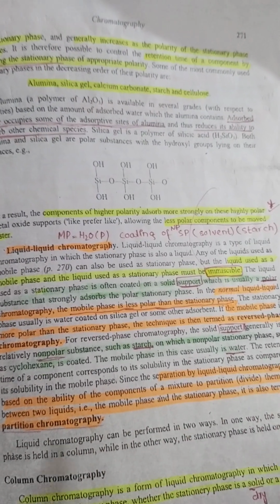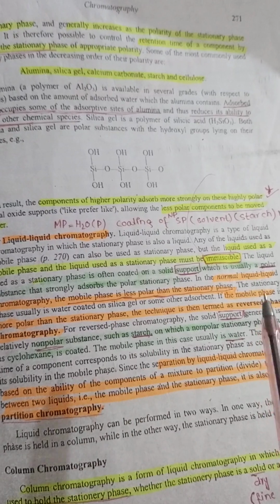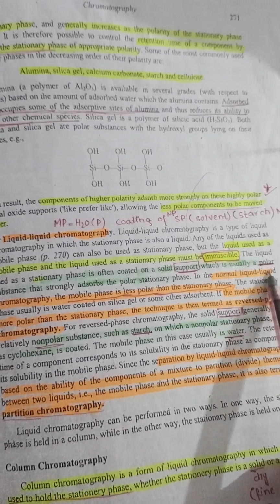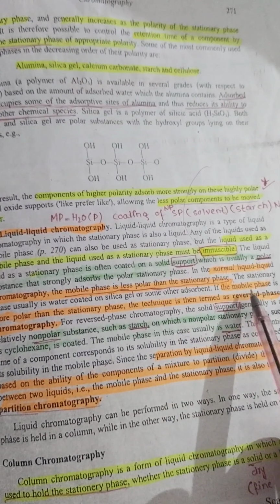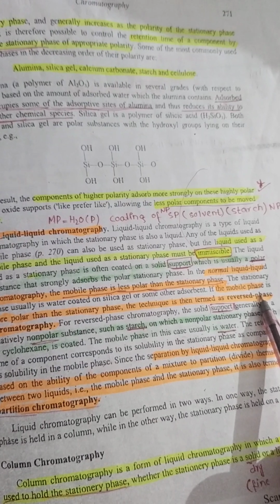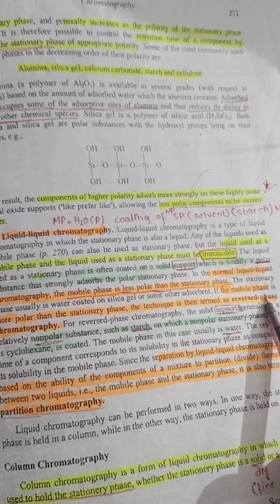We discuss again normal phase and reverse phase liquid chromatography. In normal phase liquid chromatography, our stationary phase is polar and our mobile phase is non-polar or least polar. But reverse phase is the opposite of normal: the stationary phase is non-polar and the mobile phase is polar.